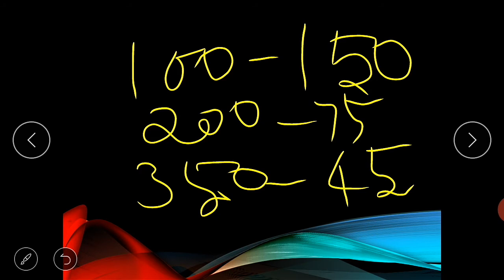After that, collect the residues left over on the 60, 100 and 200 mesh sizes separately in beakers and label them.